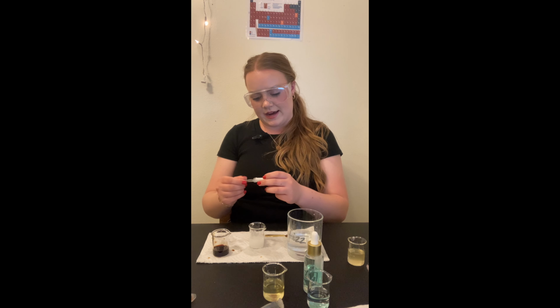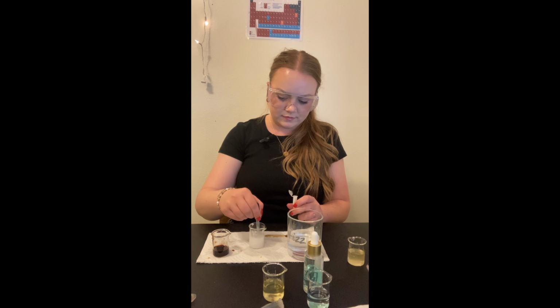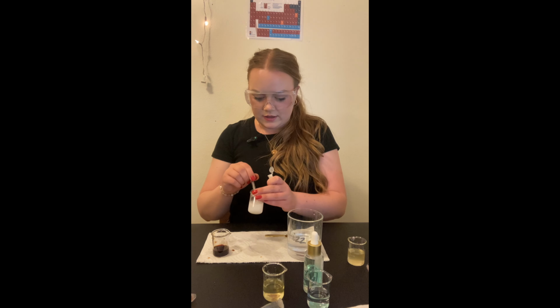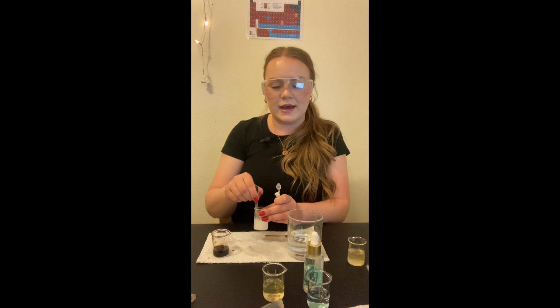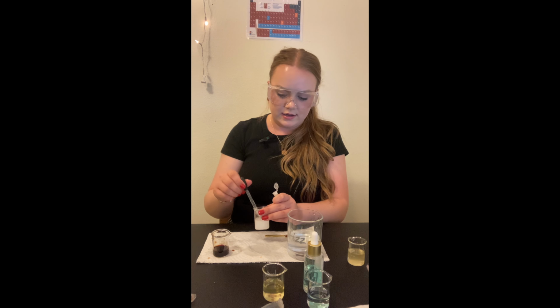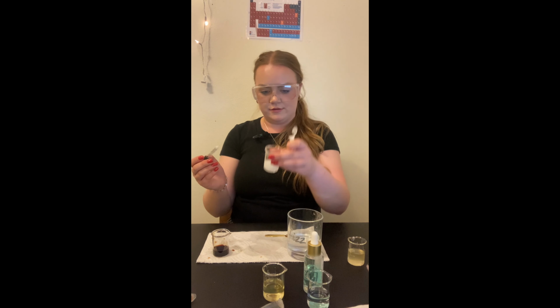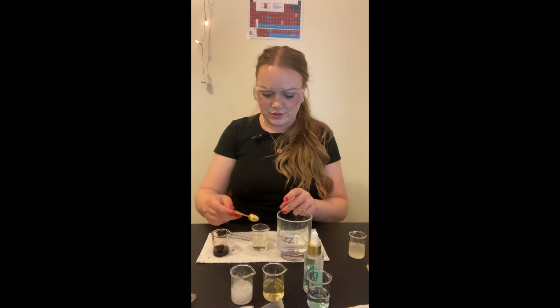Because of the opacity of the serum, it's really difficult to tell. But I feel as though this is definitely a clear solution. So I'm going to pass the tetrahexyldecyl ascorbate as effective for the PeterThomasRoth serum. Our iodine solution.